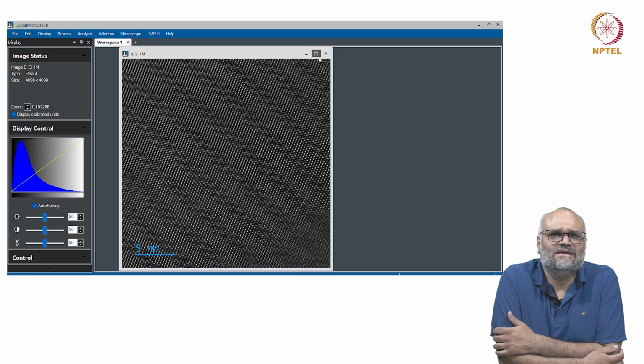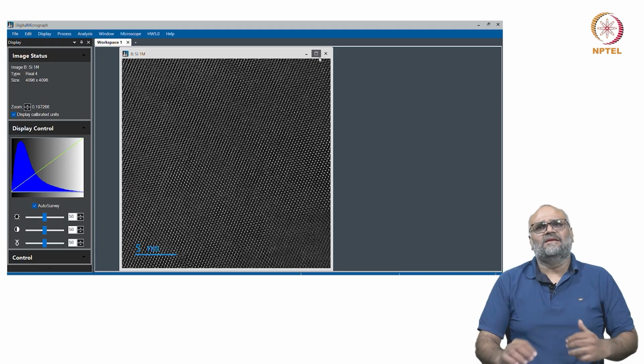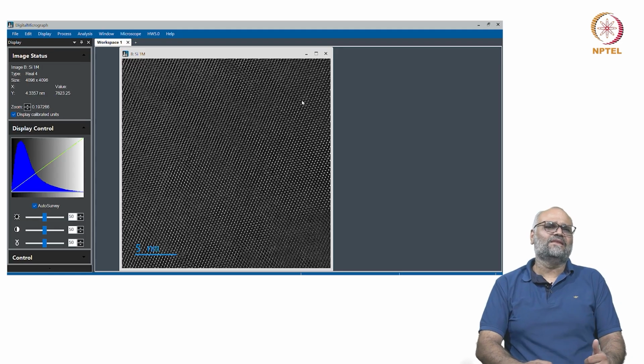And then with the STEM micrograph and also with the EDS maps, let us see how to prepare a simple image that is presentable for a publication. I'll also show you an example from in-situ movies. You record image stacks, and let us see how you process stacks. Now, processing a single image itself is a task in its own, and processing an image stack can often be quite time consuming. But it is worth the whole thing in the end.